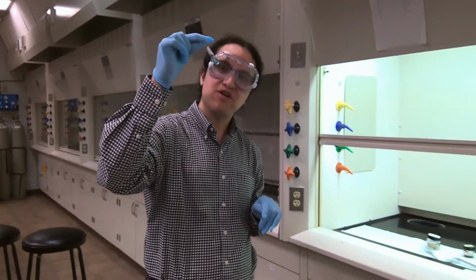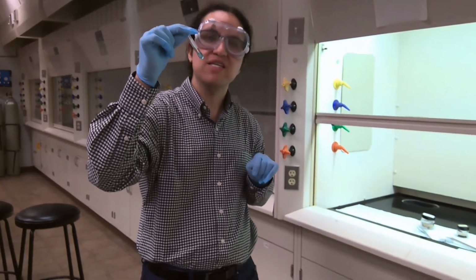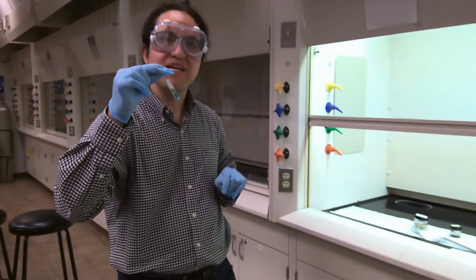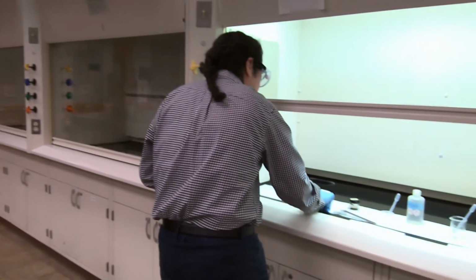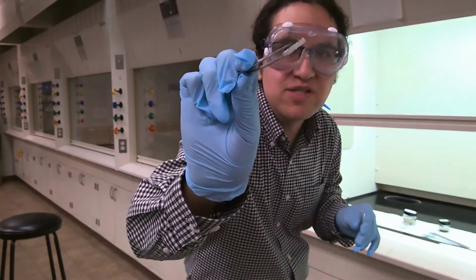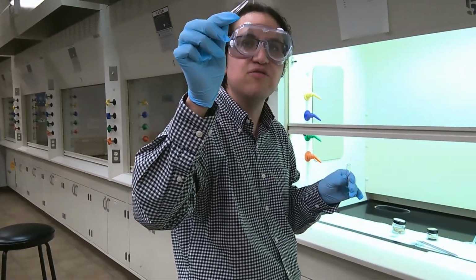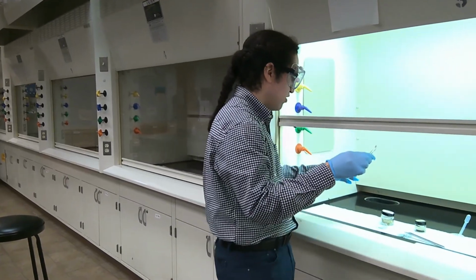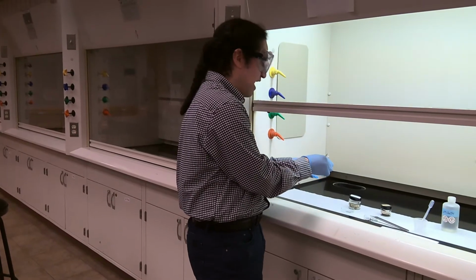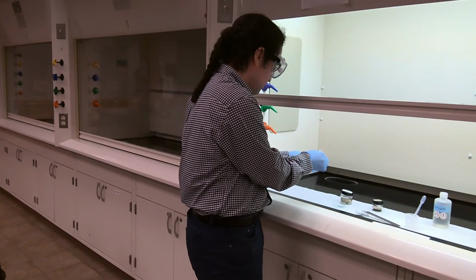I'd like you to observe, and I'd like you to tell me what is the gas being generated in this experiment, and I'd like you to really focus on what's going on at the surface of the magnesium. Is it changing color? So here's what a magnesium strip looks like. It's silver metallic. I'm going to drop this into my test tube, and we're going to observe what occurs. And of course, I'm going to keep the test tube pointed away from me, and I'll bring it closer to the camera once the vigorous reaction is somewhat progressed.